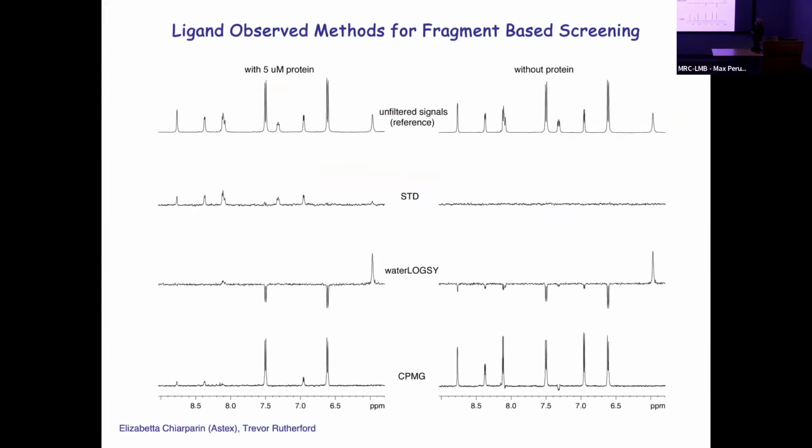This is a series of experiments that we can use to distinguish. In this case, we've got two small molecules, one which binds to the protein and one which doesn't, and a series of experiments that will discriminate between the behavior of the two in high throughput or moderate to high throughput.